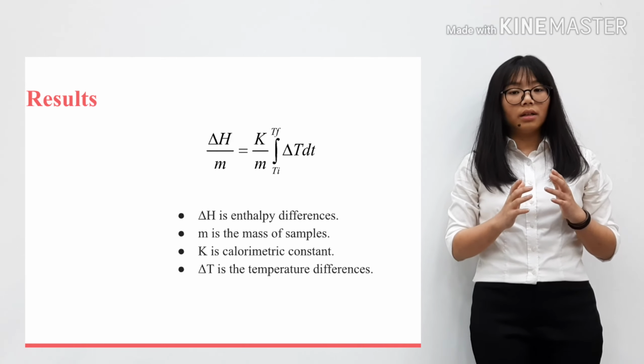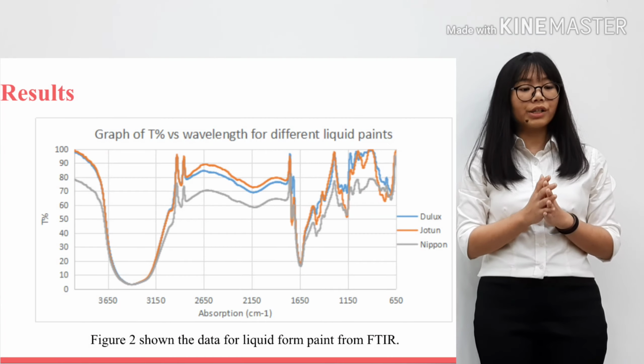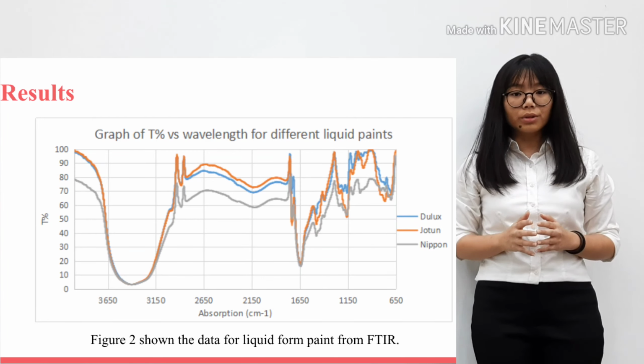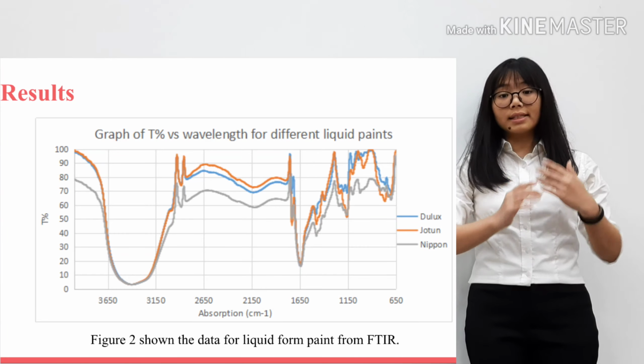to see the difference and also compare between the 3 samples. Now I'm going to present another part, where we are using the FTIR to look for the bonds inside the samples we have.